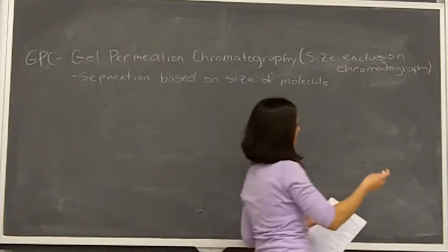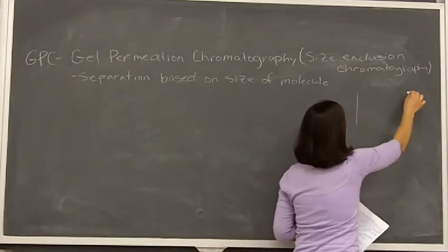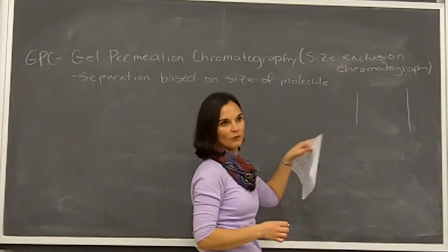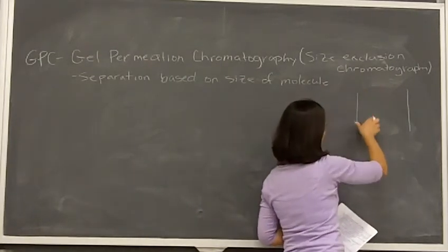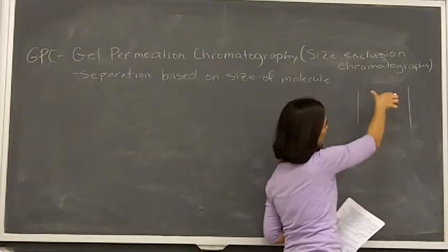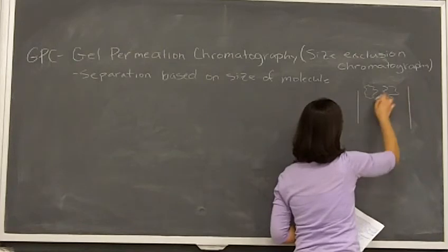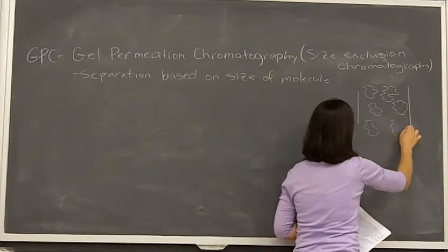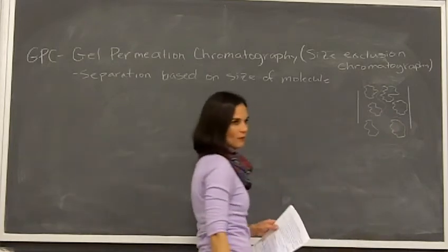And so what's going on with this type of chromatography, and we're going to talk a minute about chromatography in general. Usually when you're talking about chromatography, you're talking about some sort of separation technique. Okay? And we'll use quite a few different types of them this semester. With size exclusion chromatography, what you've got is this column, and it's actually a really thin column, but we've got to draw it so we can see. You've got this polymer support in this column, okay? So you kind of got these globs of polymer all in this column, and the molecules have to find their way through that column, okay?